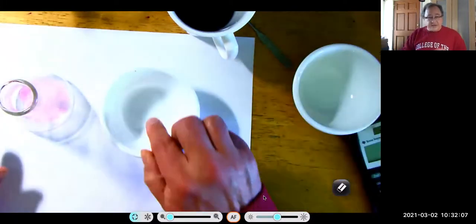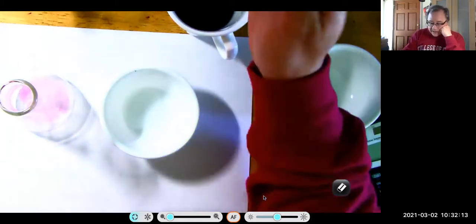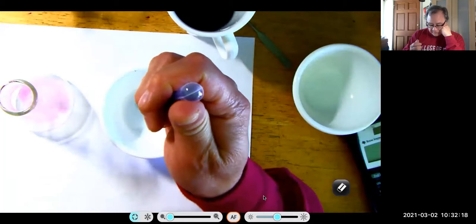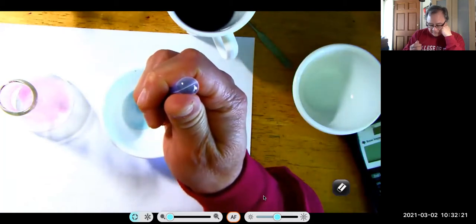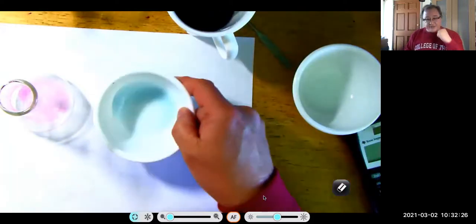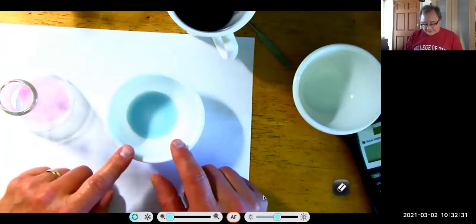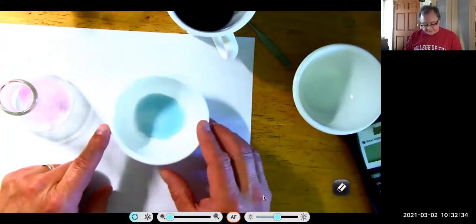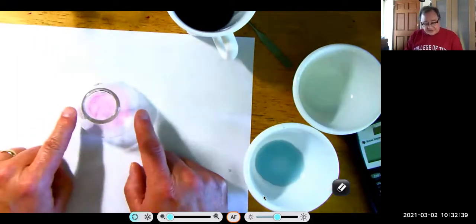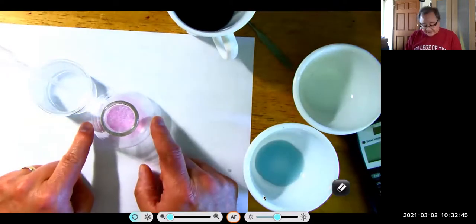Now in this container here, I put my rinse sodium bicarbonate, and let's see what happens when I add my indicator to that. Okay, so you can see that it's blue. This is the color we're looking for our endpoint. Okay, that bluish color. So what I'm going to do now is titrate this with my sodium bicarbonate solution until this turns blue and stays blue.